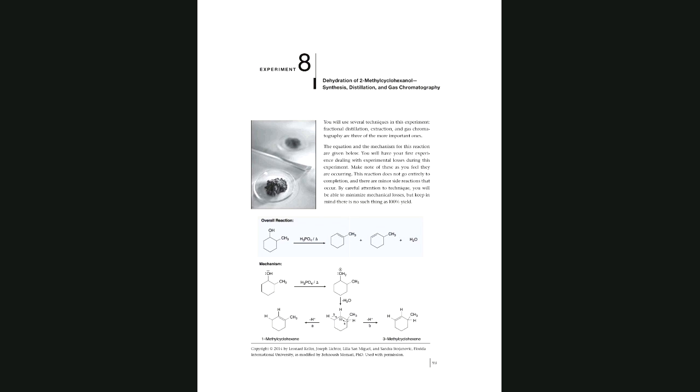It depends on whether you have a liquid or a solid in the lab after you prepare the product. Then you compare to the literature value. If the melting point of the product matches the melting point in the literature, then your product is confirmed to be pure, and that confirms the product has formed.